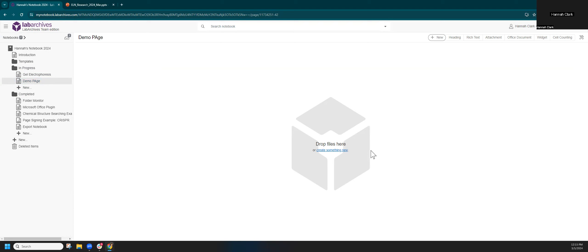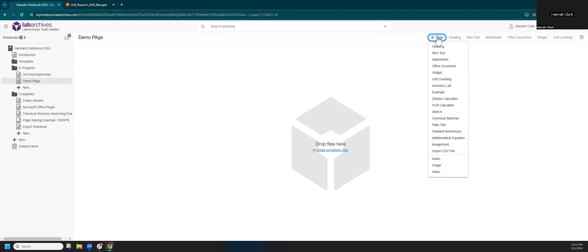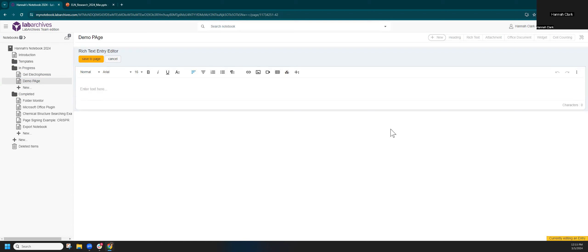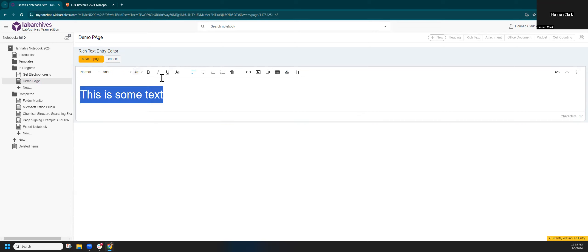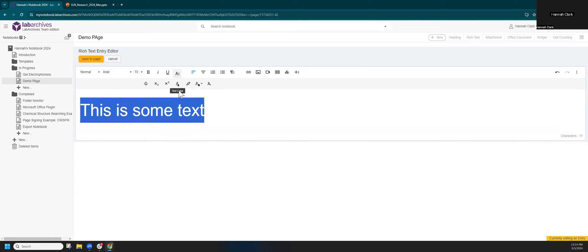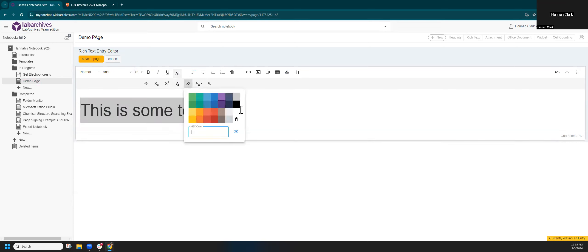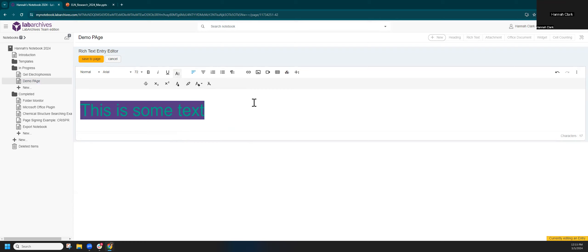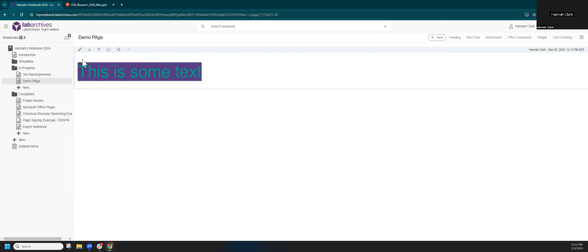To add entries to a notebook page, you can drop files directly onto the page or click 'New' and select an entry type. We have a lot of entry types. Our most common is rich text — for notes, observations, tables, embedded images, and videos. I'll type some text, format it to make it bigger and change the styling, and when I'm ready click 'Save to Page.' The entry is added with a date and time stamp. There are tools for editing the entry and moving it around.